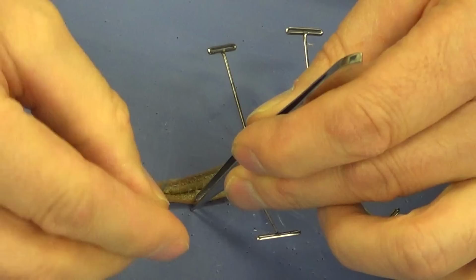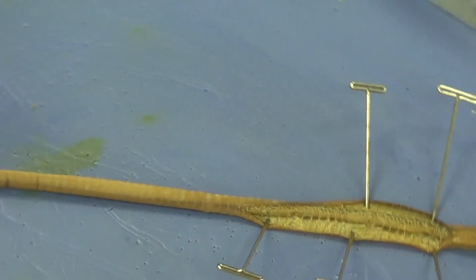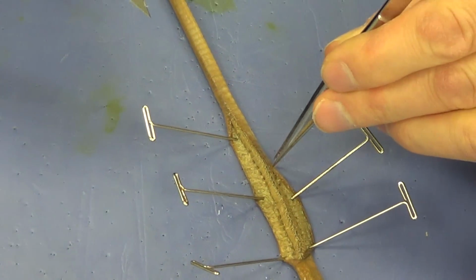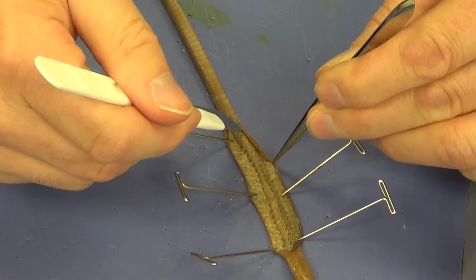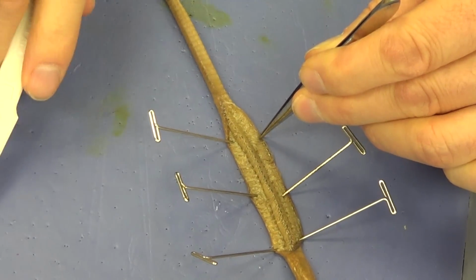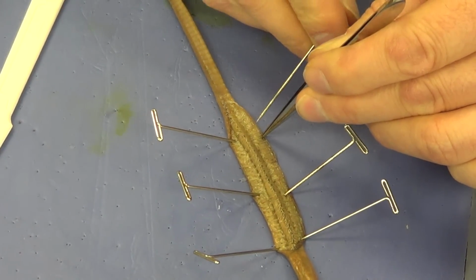And I'm going to go ahead and pin this side. Now, as we do this, if you're working in a group of two, make sure that only one pair of hands are in here at a time. So I'm going to go ahead and go down the other side here. And again, I just work my way down a half an inch to an inch at a time.